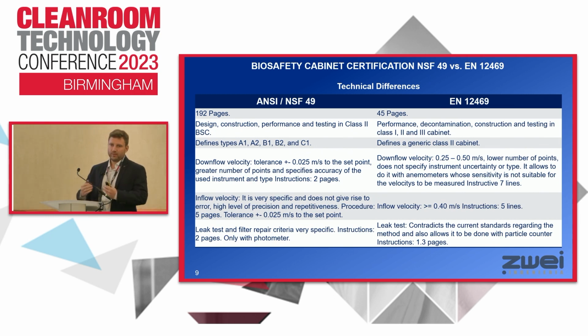Inflow is the air barrier that protects us from the escape of pathogens and protects the samples from being contaminated from the laboratory air.